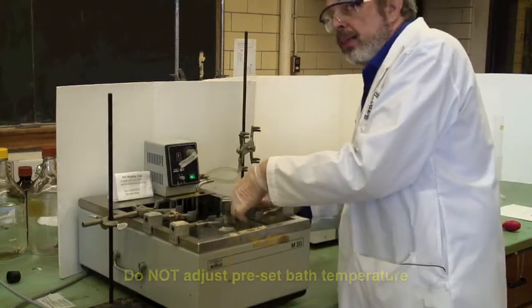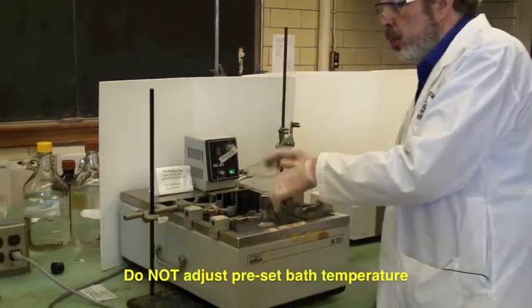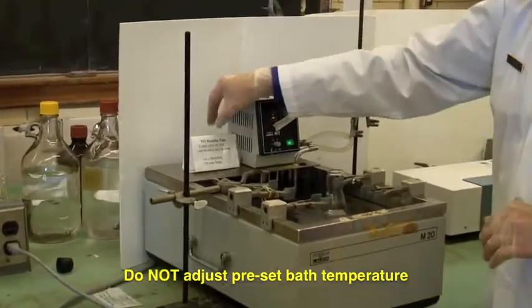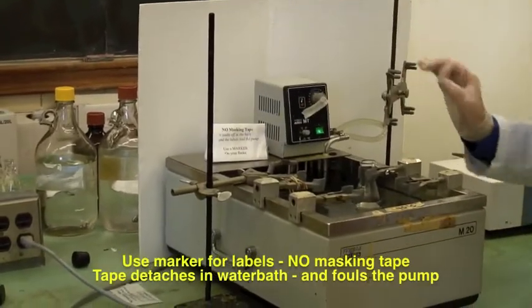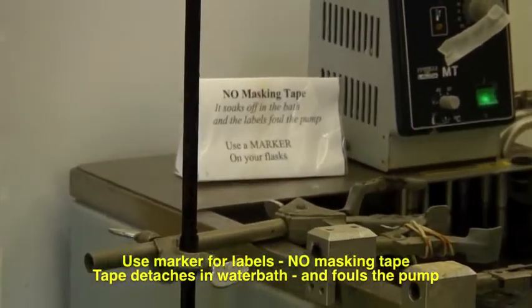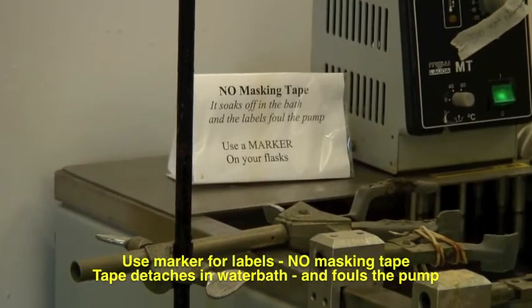The temperature baths are preset at temperatures. Please do not adjust this. The other thing to point out to you is this sign here.